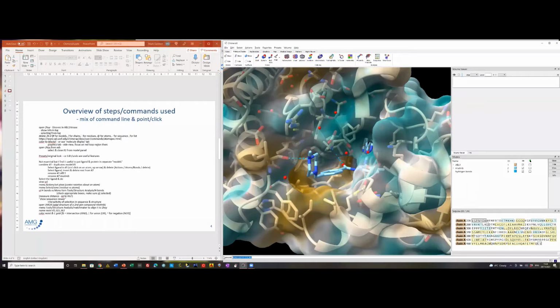So that's given that set of residues, that pair of residues, a name, and then we can manipulate those. We can select them, for example. So user defined selections, now you can see that resist has come up, and that's the name I've given those.